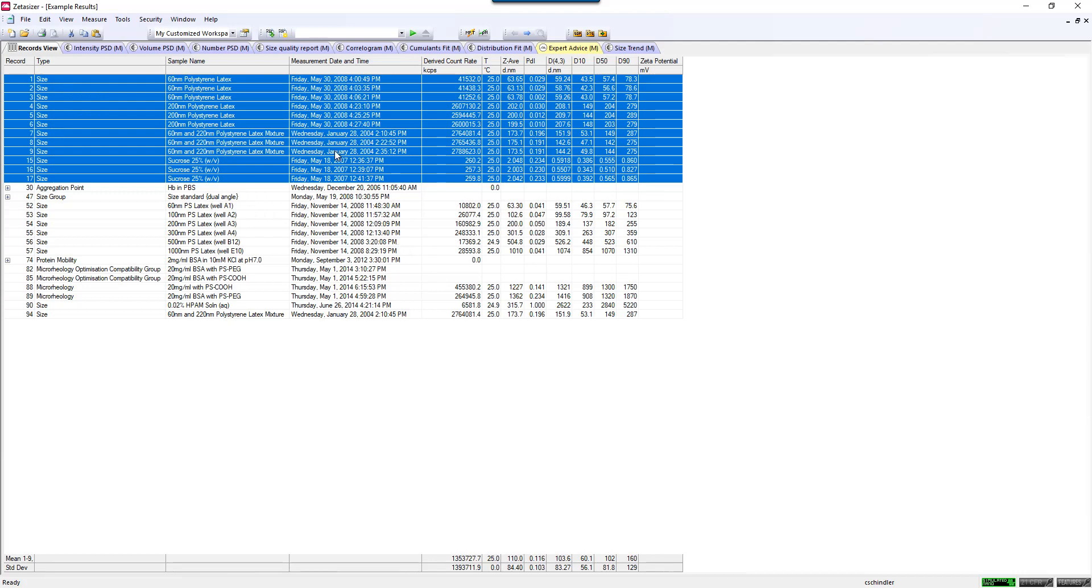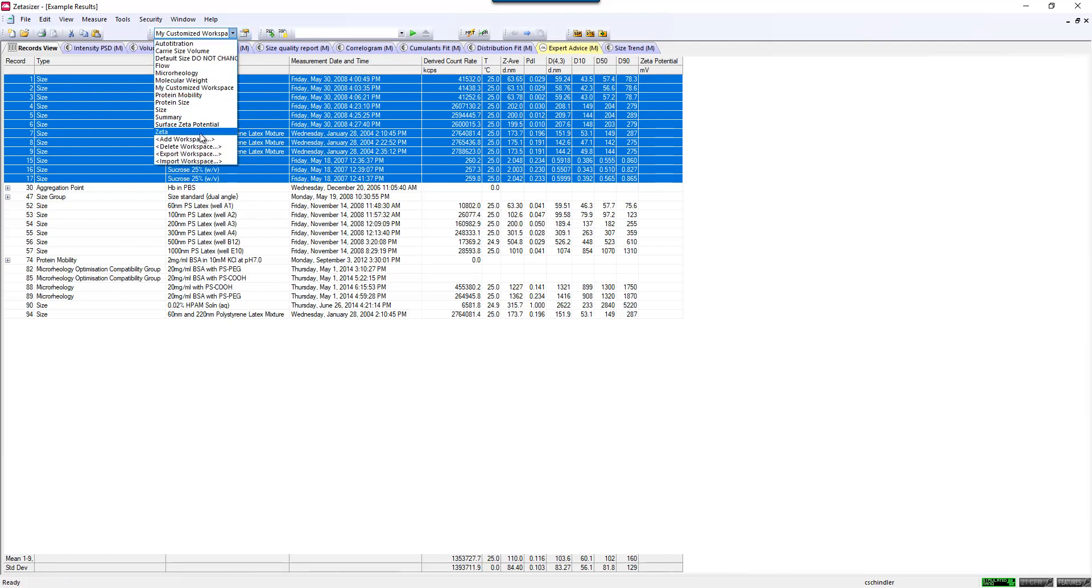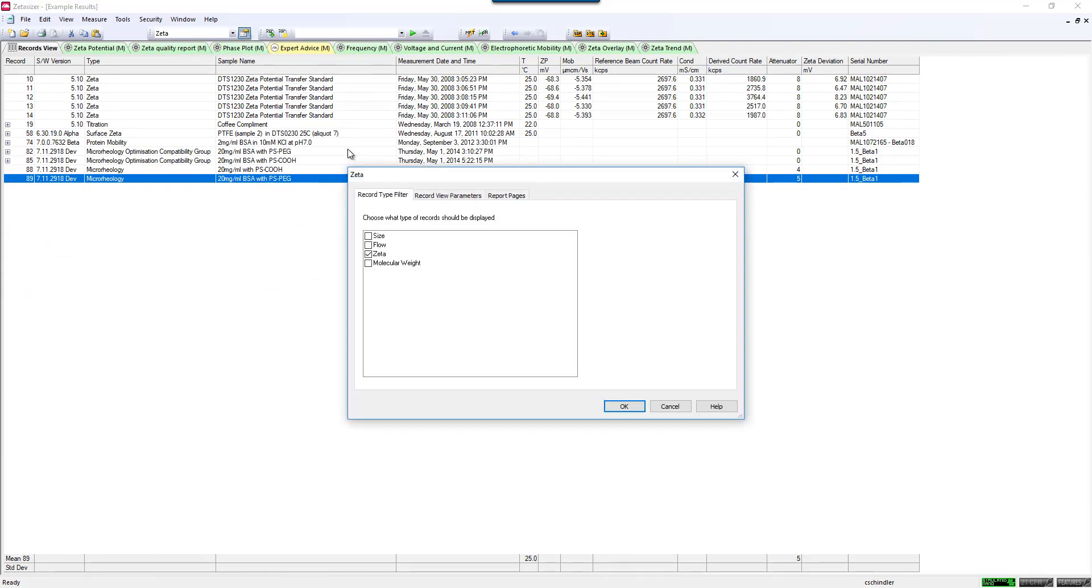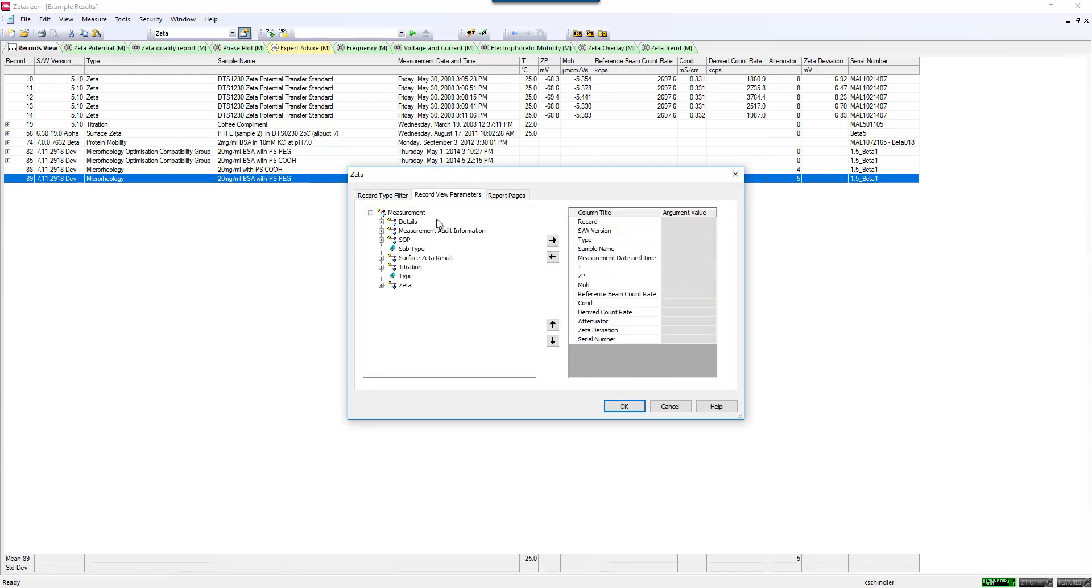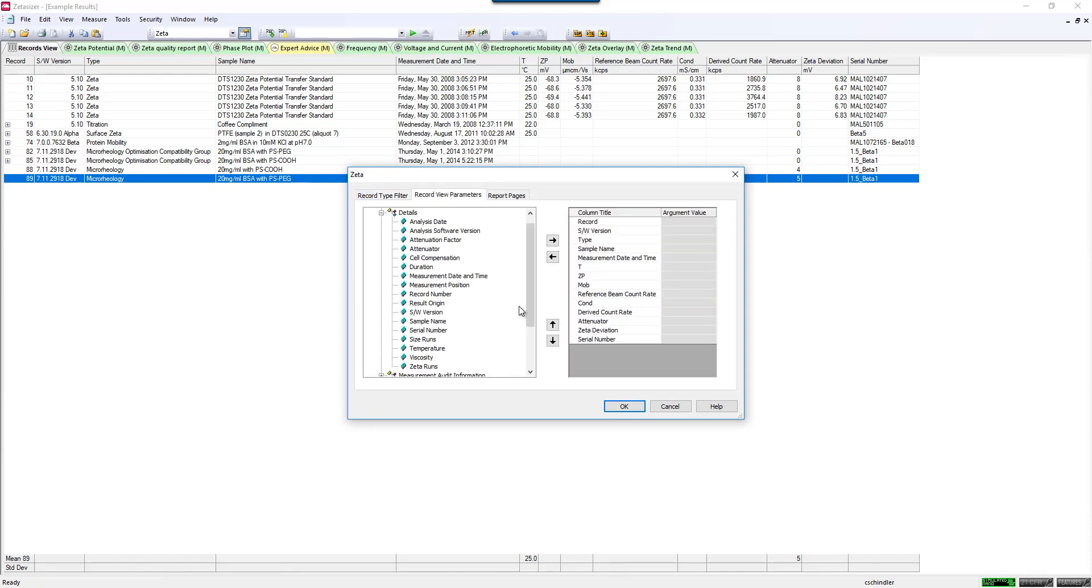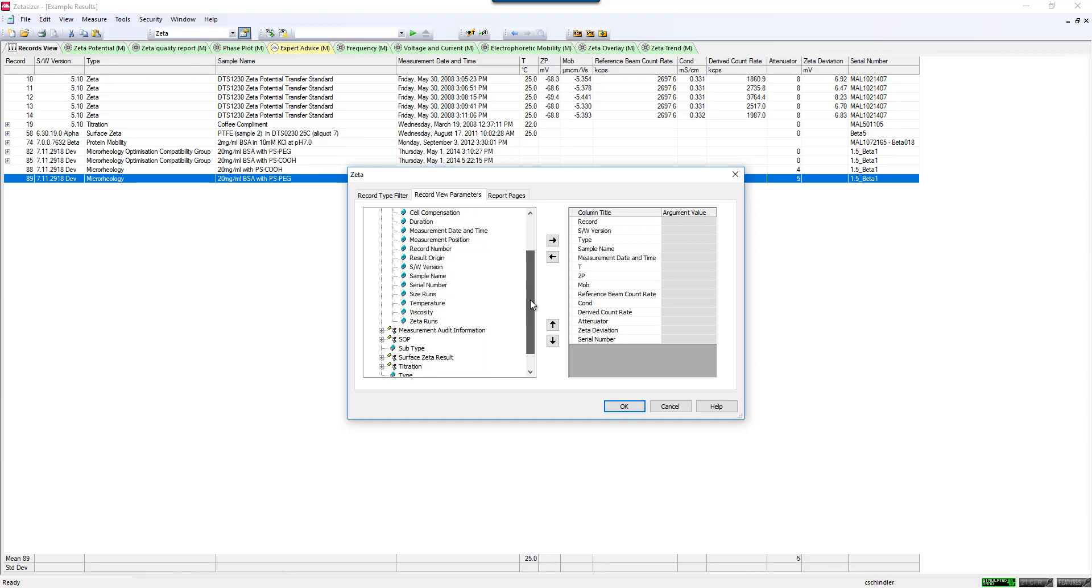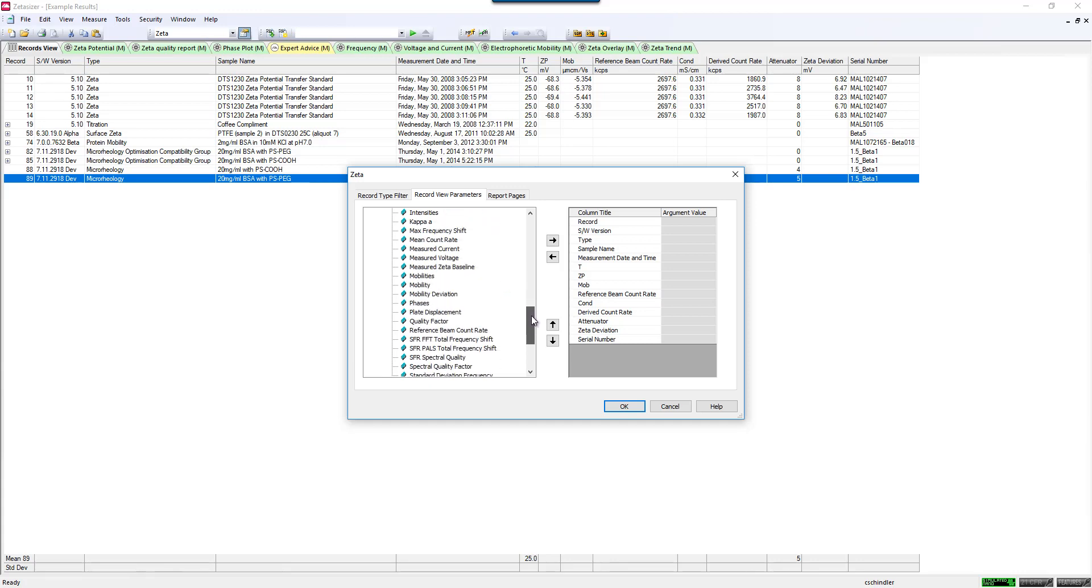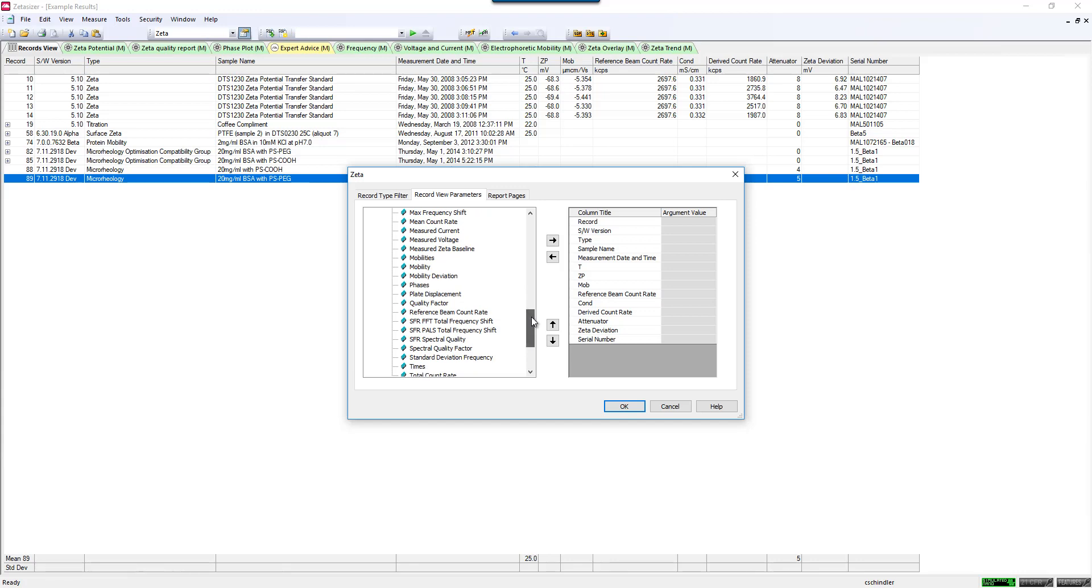I'll mention quickly some other parameters for zeta potential that I think might be interesting for you to look at. Let's go into the configure and go to the parameters. Some of the things that you'll see in here are quite similar, like your measurement date and time and all of those things. But here are some that are specific to zeta potential. One of them that I'd like to point out, of course, derived count rate and attenuator both play a role here as well. But one of them that I would like to point out is the reference beam count rate.